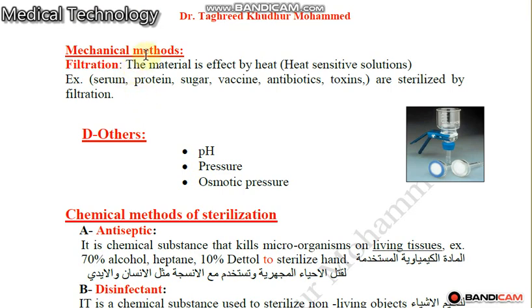Mechanical methods. In the mechanical method, we can use different types of filters to filter materials which are considered heat-sensitive solutions.